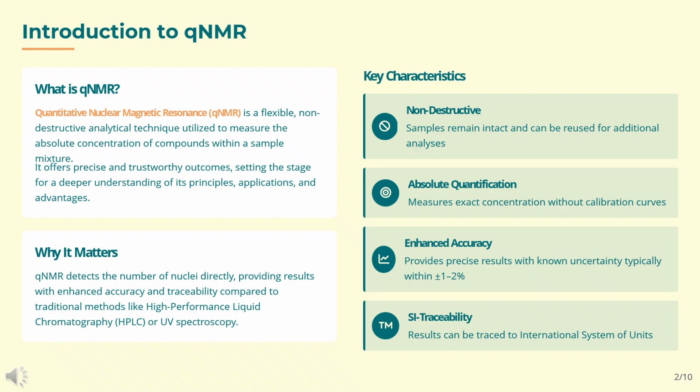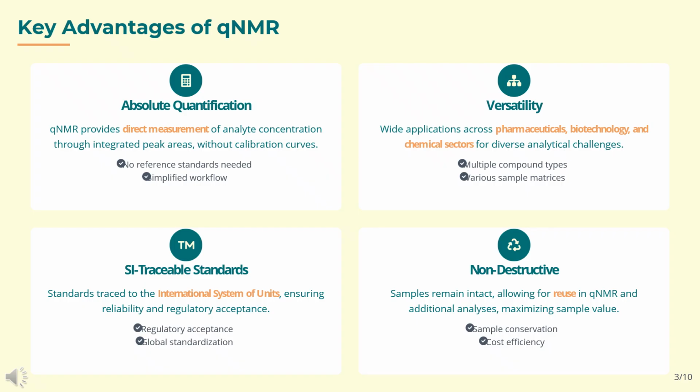Well, in research or regulated industries, accuracy and reproducibility are everything. qNMR gives you confidence that your measurements are not only precise, but also SI traceable, meaning they can be tied to the international system of units. Let's look at the advantages that make qNMR so valuable.